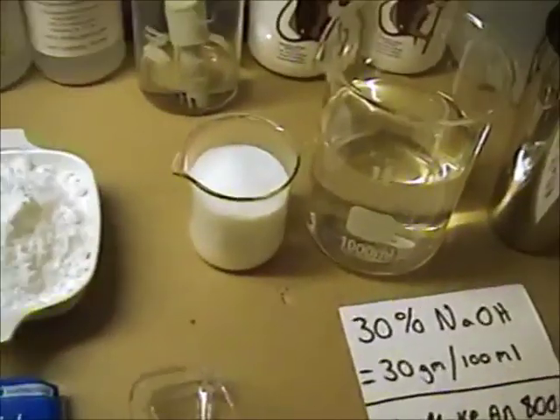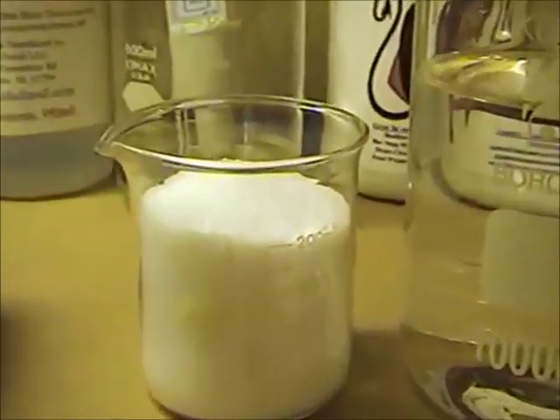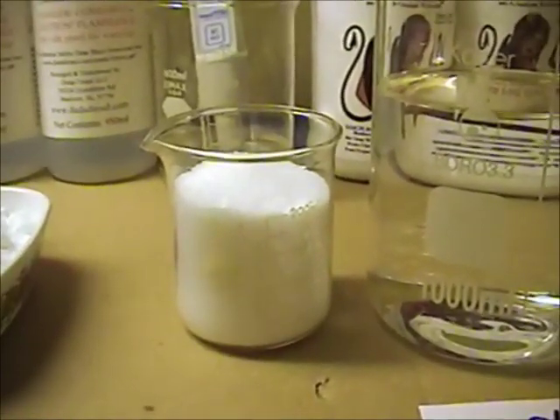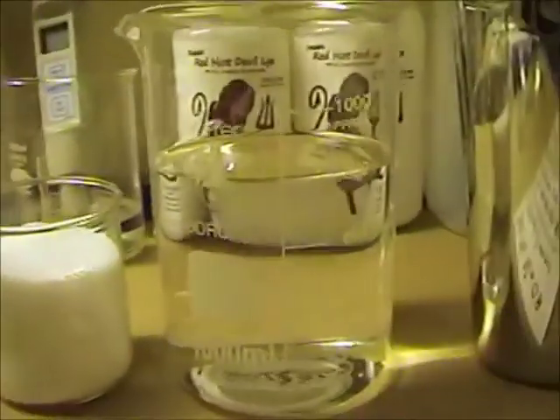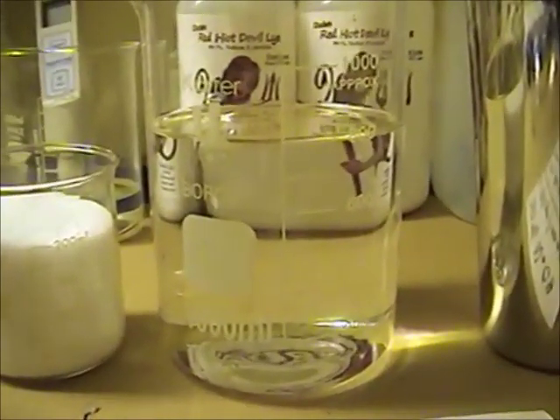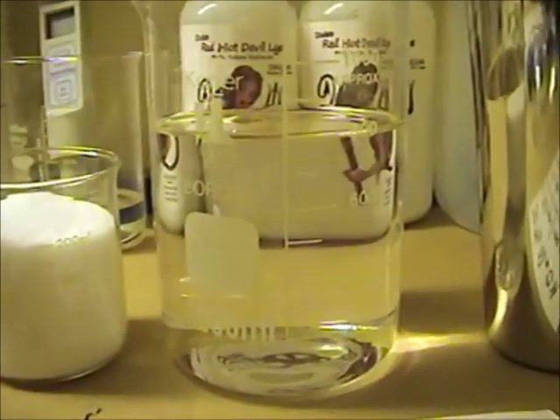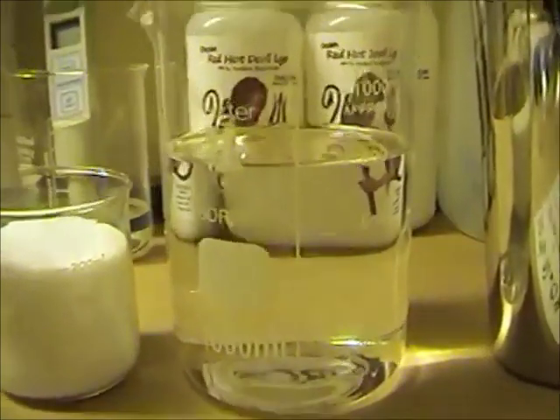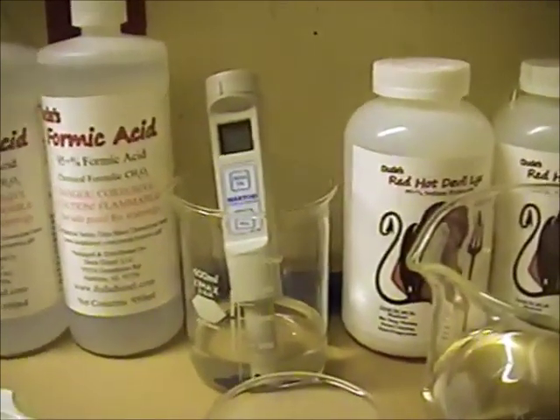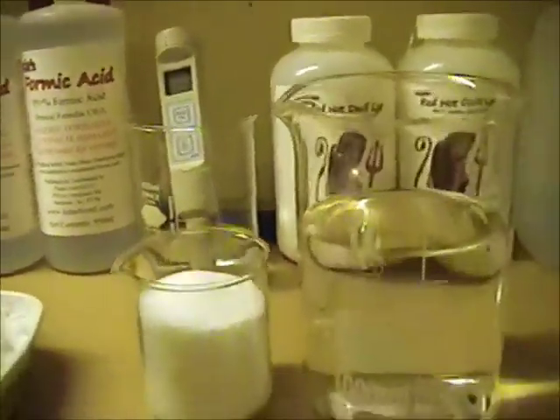Back here you'll notice that is a 200 milliliter beaker, and those are food grade sodium hydroxide prills that we have in there. We're going to dissolve that into 800 milliliters of water, and that'll give us a 30% solution of sodium hydroxide. Now, how much do we use? We don't know. That's what our pH meter is for in the back. I've already set up our pH meter. I have calibrated it, and it is sitting just in tap water waiting to be used.